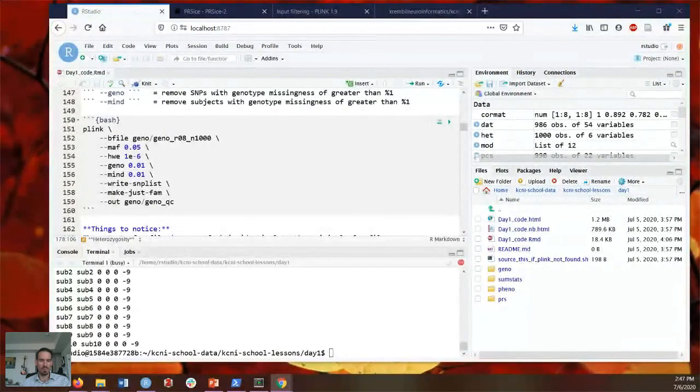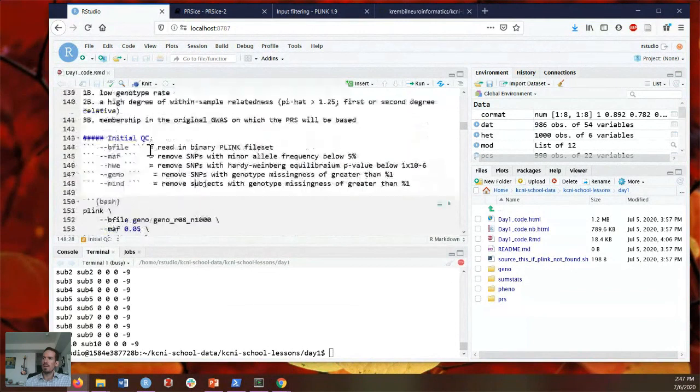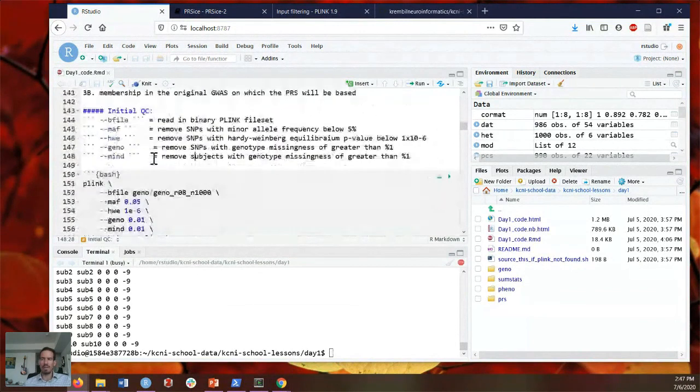There we go. Okay. So we are right here where we left off. I will briefly explain some of the commands that we're going to enter for each round of Plink. More importantly, I'm just going to give an impression of how Plink syntax works. You'll be able to reference the Plink website whenever you like and get key materials from there and more in-depth descriptions of how each call and each command and each option works in terms of what it excludes, what it includes, how it performs its quality control.